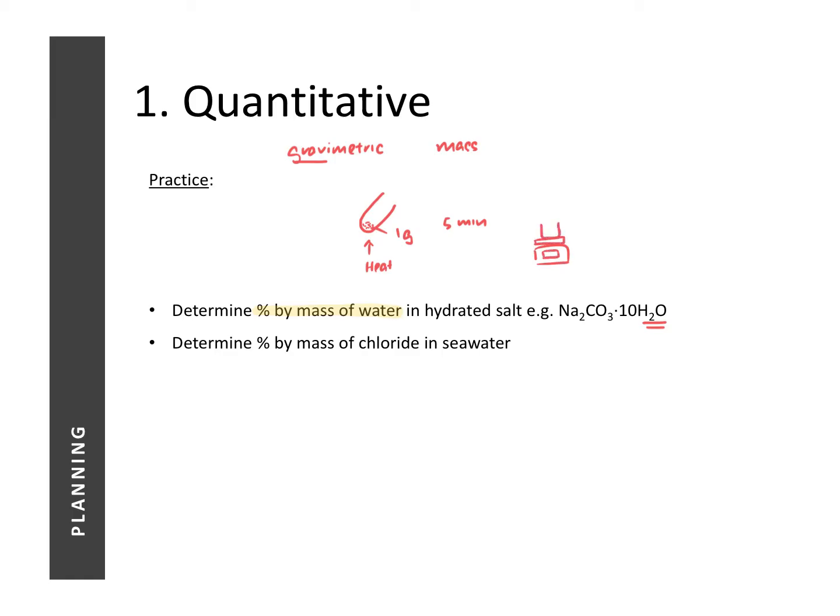And then you repeat the heating. Now, this is important because you need to ensure that all the water of crystallization has been driven off. So you need to continue heating until you have two measurements which show the same mass, meaning on prolonged heating, on further heating, there's no further loss in water of crystallization. So that would indicate to us that all the water of crystallization has been completely driven off.